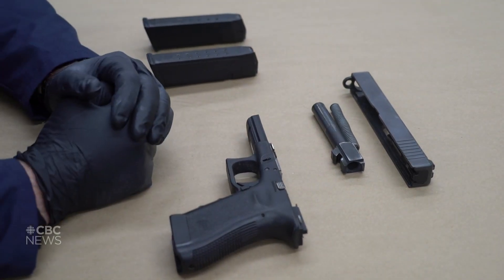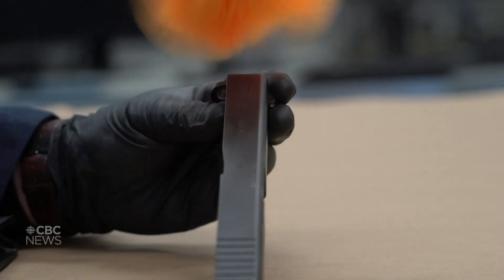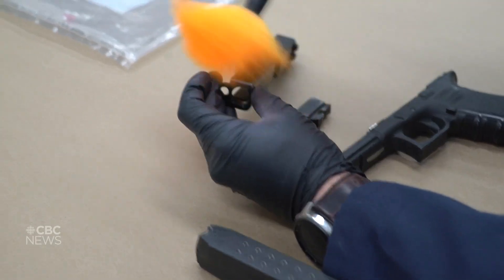If somebody has handled this firearm, there's a good chance that they have left fingerprints on it. I've laid some fingerprints on the slide here, and I'll apply some fluorescent orange powder. Then we'll go and look at it in our laser room.